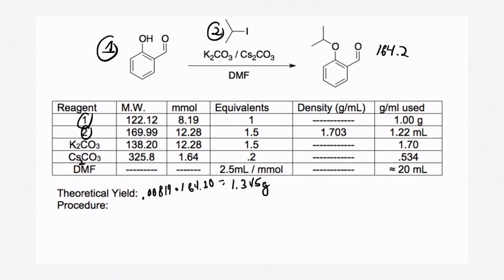The last part of this is going to be filling in the procedure. Here you'll include in-depth description of the types of glassware that you're using, the workup procedures, TLC data, and any color changes that you see, so that if you or somebody else has to repeat this experiment, they'll have a heads up on what to expect. Alright, that about sums it up.